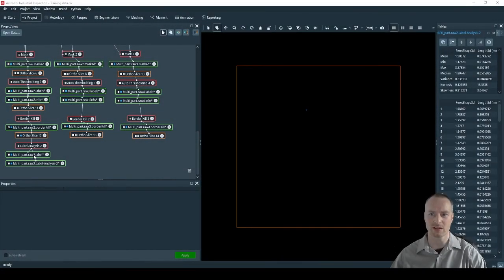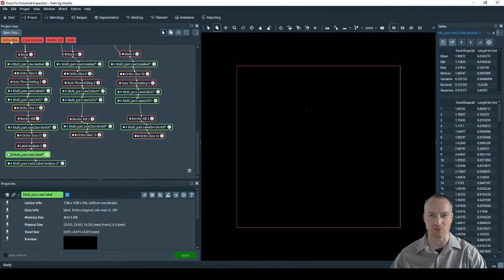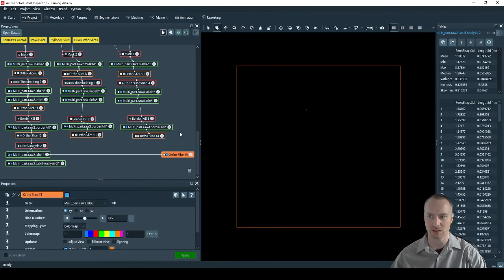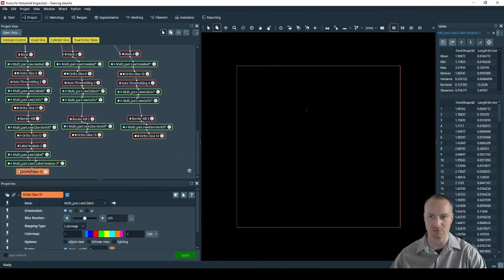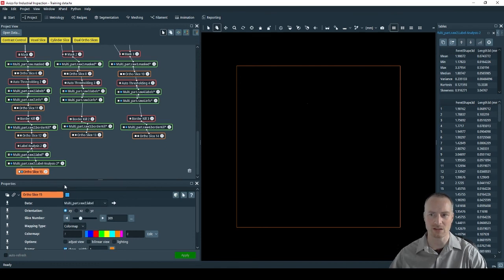Once the pore analysis is complete it will give out a label field. In the label field each pore is given a different color. This can be seen using an author slice. We can now repeat this for components two and three.